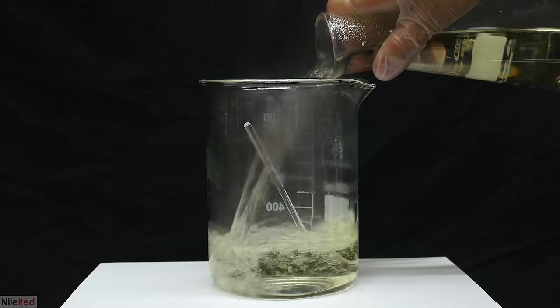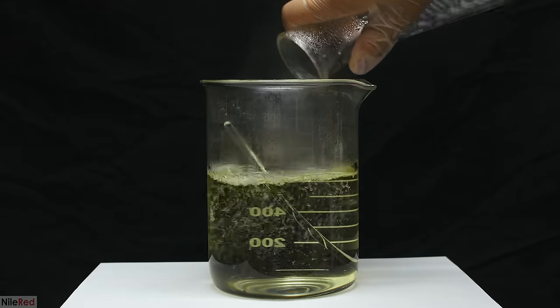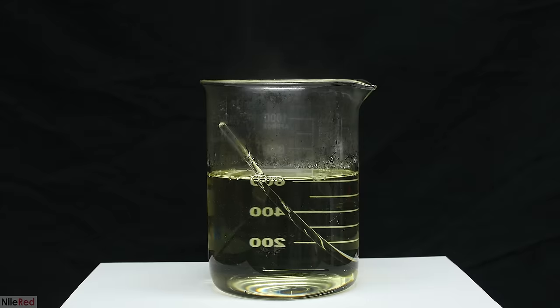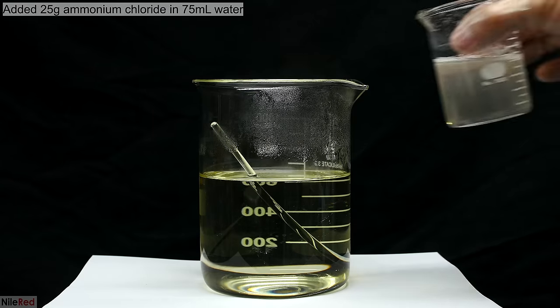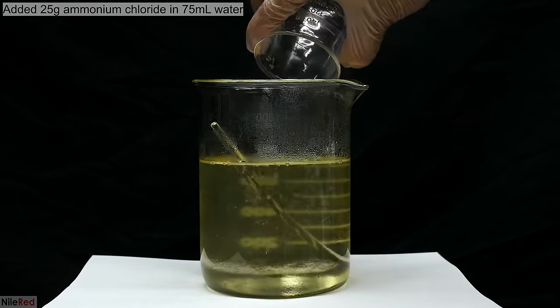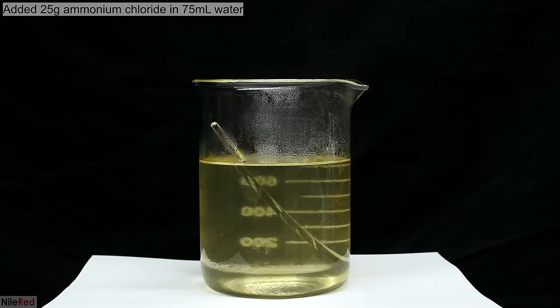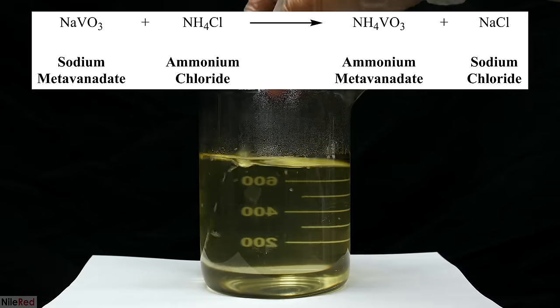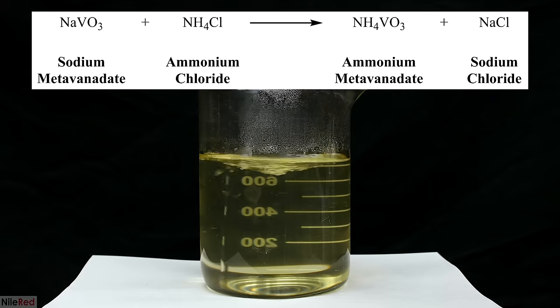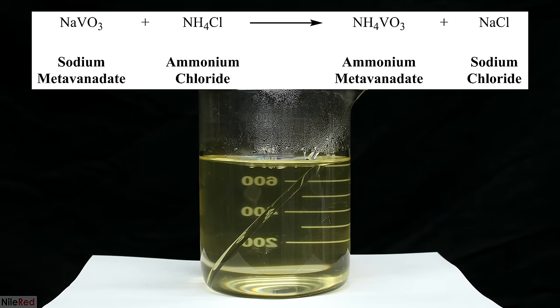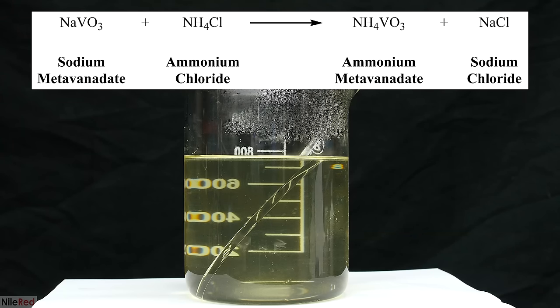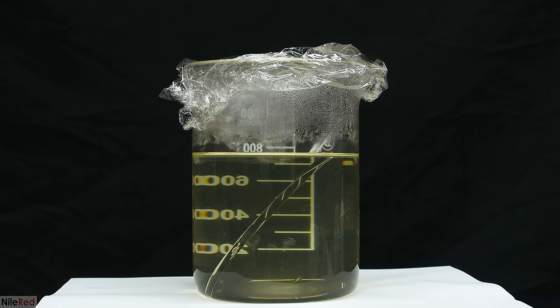Our now filtered hot sodium metavanadate solution is transferred to a clean 1 liter beaker. 25 grams of ammonium chloride is dissolved in about 75 milliliters of water, and this is dumped directly into our hot solution. What occurs here should be a double displacement reaction, where we make ammonium metavanadate and sodium chloride. Sodium chloride is very soluble in water so it will stay dissolved, but the ammonium metavanadate should precipitate out. Eventually things had cooled down to room temperature though, and nothing had precipitated out.